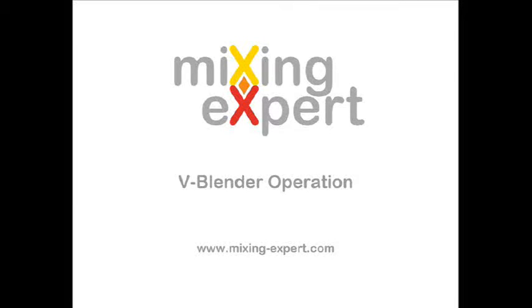Welcome to Mixing Experts. This video features the design and operation of V-Blender. V-Blender is made of two hollow cylindrical shells joined at an angle of 75 to 90 degrees. The blender container is mounted on trunnions to allow it to tumble.